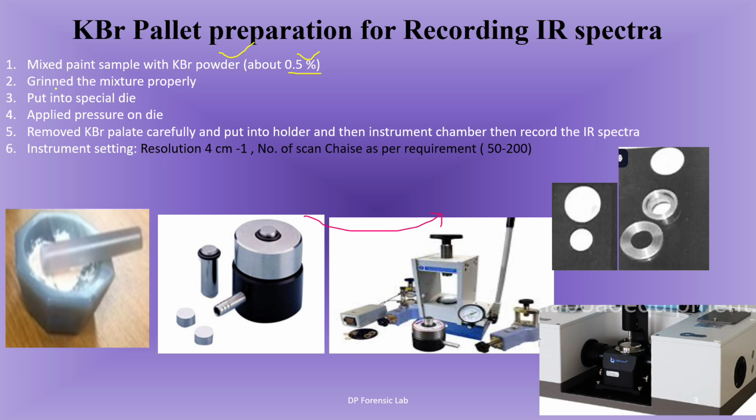Grind the mixture properly. The sample should be mixed with the KBr and ground manually. Then put it into a special die.